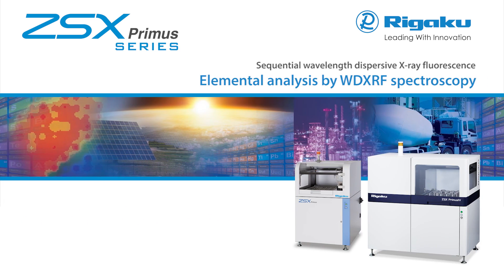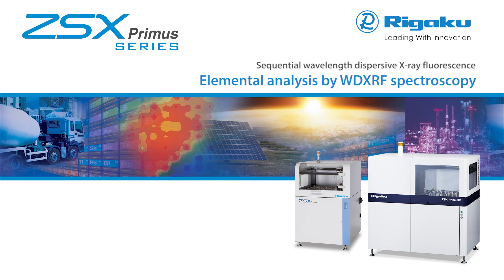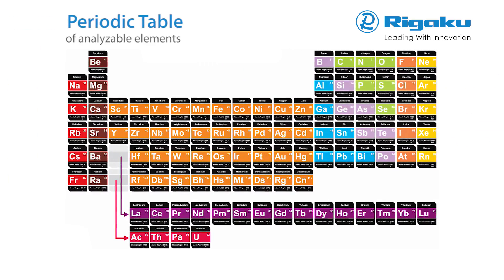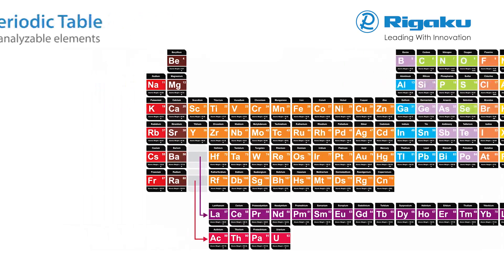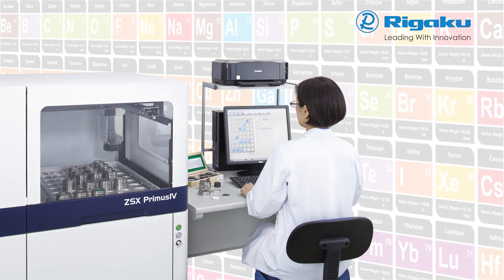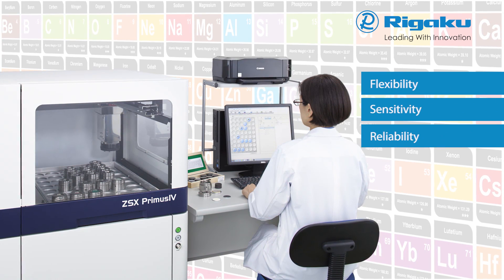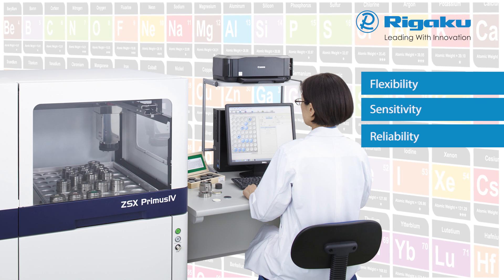Rigaku ZSX Primus WD XRF spectrometers deliver rapid quantitative determination of major and minor atomic elements, from beryllium through uranium in the widest possible variety of sample types, with or without standards. ZSX Primus series delivers unequaled flexibility, sensitivity and reliability — the three core requirements that underlie the superior value inherent in all Rigaku XRF instrumentation.